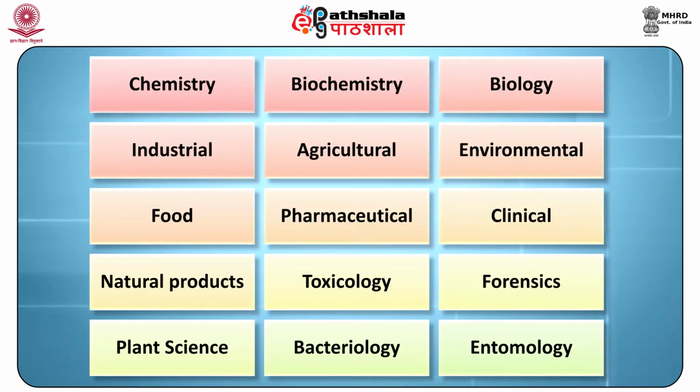The TLC has been applied virtually in all areas of analysis, including chemistry, biochemistry, biology, industrial, agricultural, environmental, food, pharmaceutical, clinical, natural products, toxicology, forensic, plant science, bacteriology and entomology.